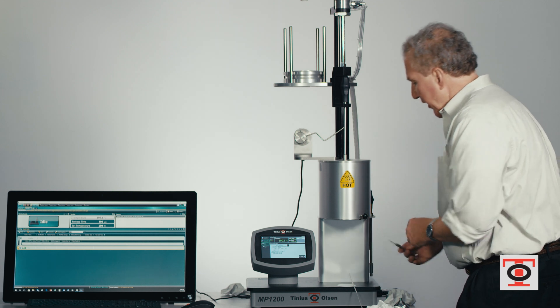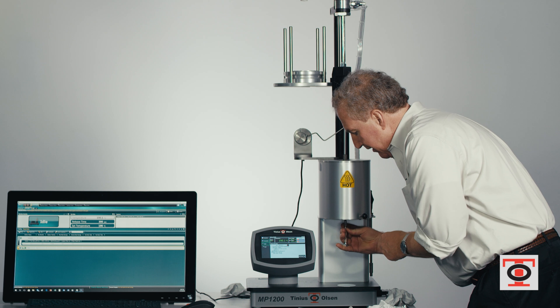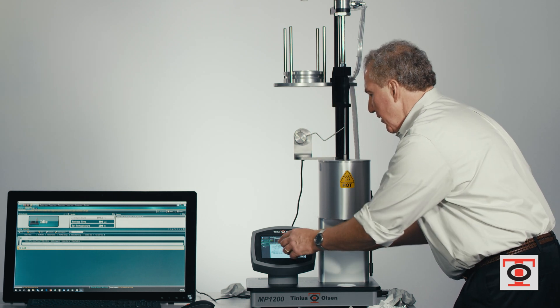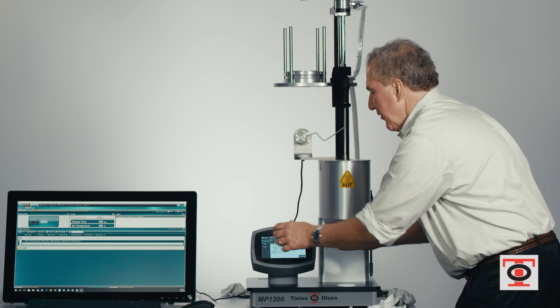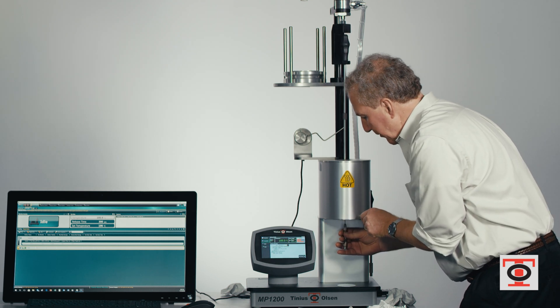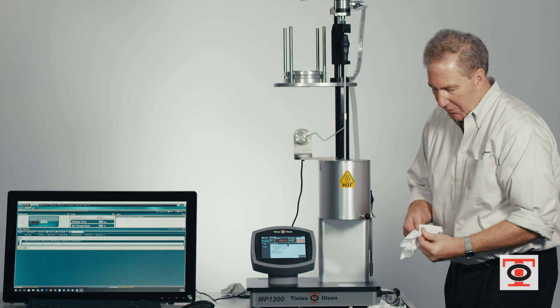We get our die removal tool and get our die in position. Then we raise our cleaning tool and simply remove our die from the bottom of the furnace and clean that as well.